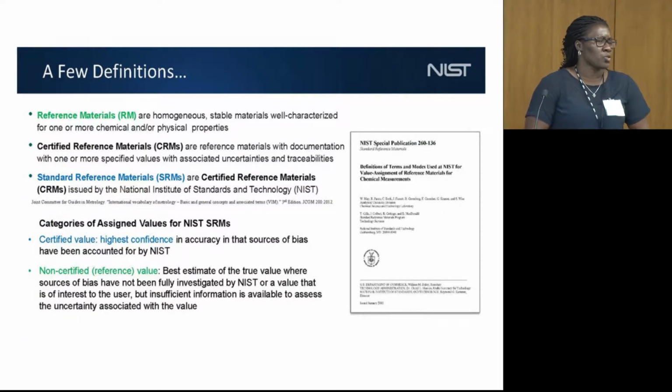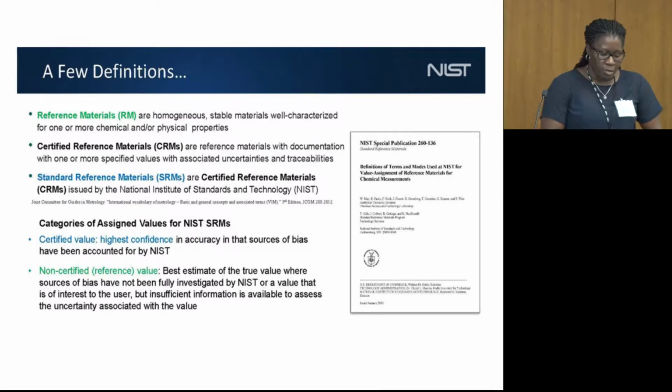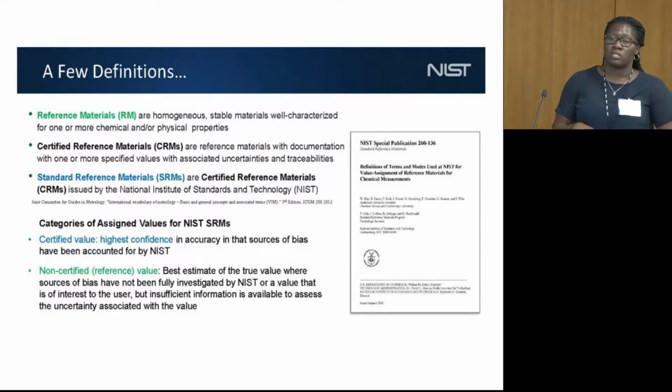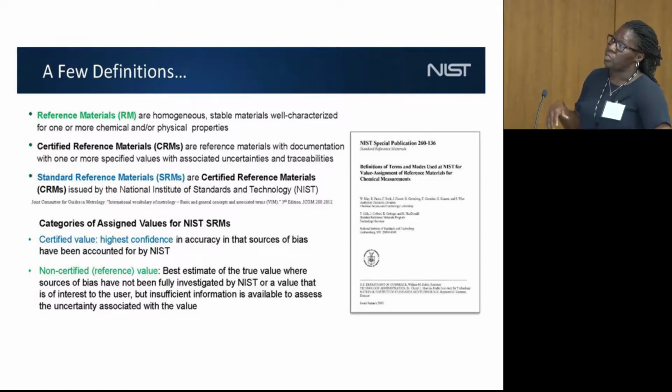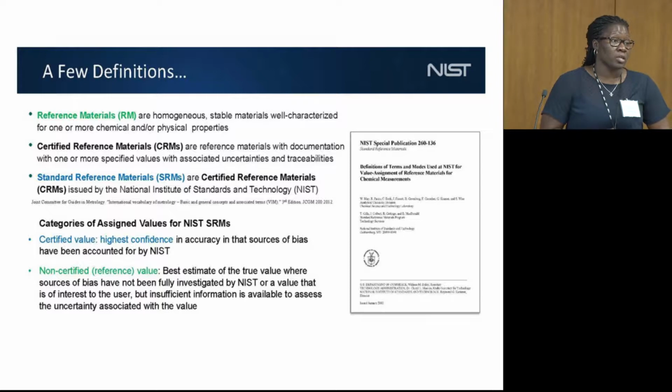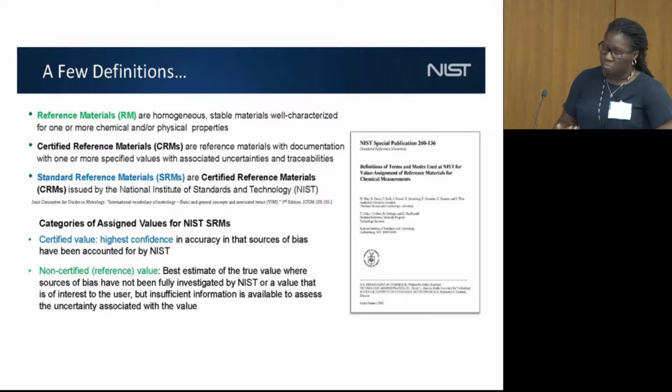So I wanted to pause and discuss a few definitions. On your agendas, I'm pretty sure on the first page, there are some definitions related to NIST reference materials. A lot of the talk has been about SRMs. So we make standard reference materials. We also make reference materials. At its core, a reference material has to be homogeneous and stable. So when you buy it at time point 0, it needs to be the same thing. If it's on our shelves and we're providing it to the public, you should essentially have the same thing when you measure it 10 years later, while we're still providing it for you to purchase.